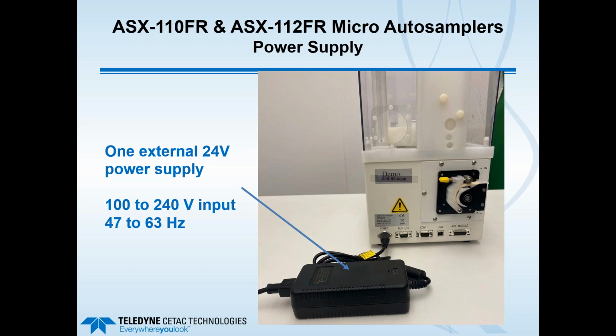Power supply to the ASX110 or ASX112 is via an external 24-volt power supply. The input ranges from 100 to 240 volts input, and then you simply attach the power cable from the power supply to the power input port on the back of the ASX110 or 112.